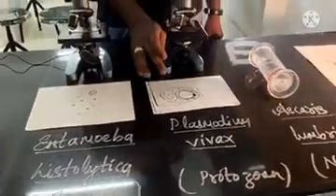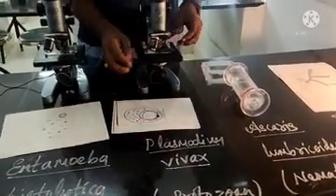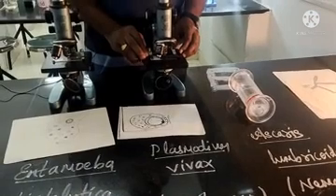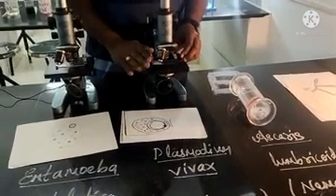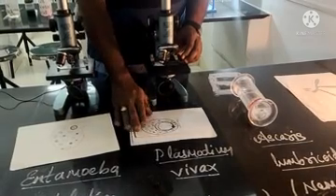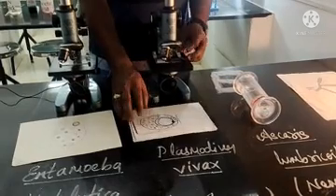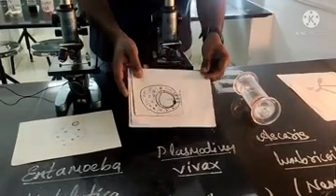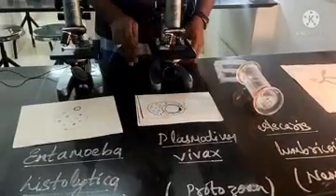Then Plasmodium vivax. Here also there is a photograph and also a permanent slide. 90% of the examiners will prefer the slide. So in rare cases you may get this photograph. Anyhow, you have to observe both the photograph as well as the slide. Plasmodium vivax causes malaria.